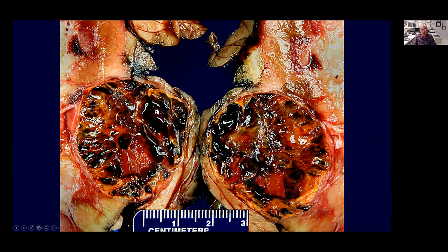As you can see, when you see these pictures in full magnification on the screen, they are going to be more reliable and with more definition as compared with a naked eye examination, which is always limited by our eyes. Photography gives you a kind of middle of the road between the gross examination and the histological magnification.